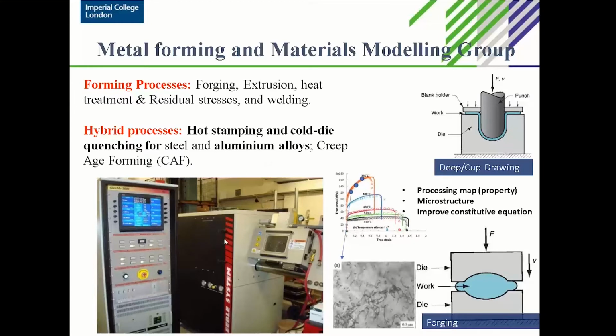Of course, this part is mainly based on the Gleeble-aided experimental work, including the stress-strain curves and also the microstructure examination during the stress-strain curves.